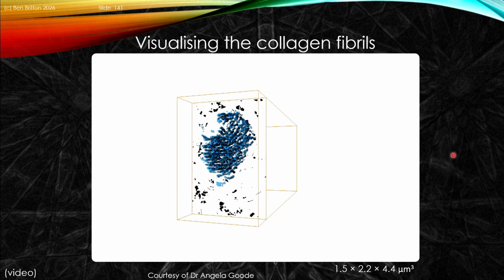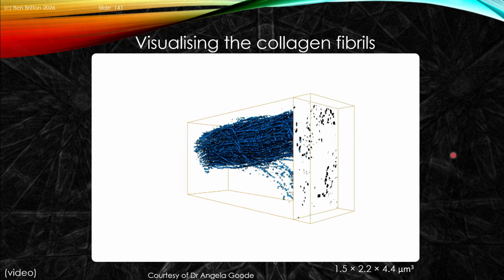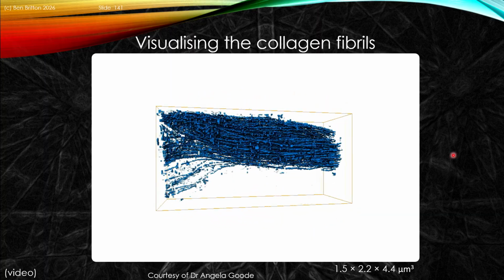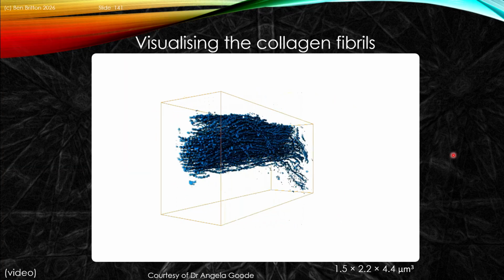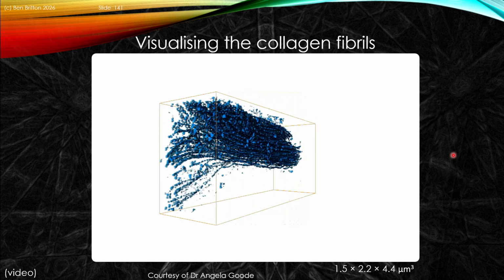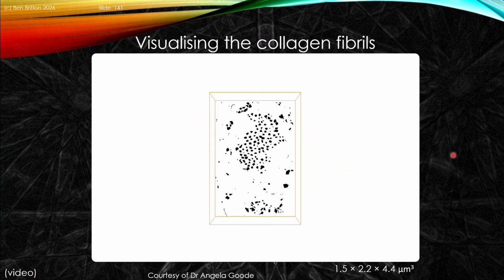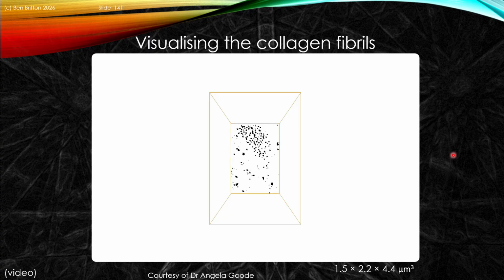And then we'll see the object rotate, and we can now draw out that three-dimensional bundle cluster. We can see, for instance, how continuous some of those fibers are and how tortuous some of the other fibers are. And this is really starting to give you an idea where that three-dimensional data is particularly useful for looking at, say, fibrous structures that can be quite hard to interpret from just a single 2D slice. Certainly if you cut this orthogonal, it would be quite challenging for you to see that structure.